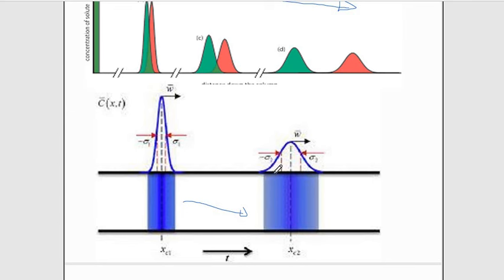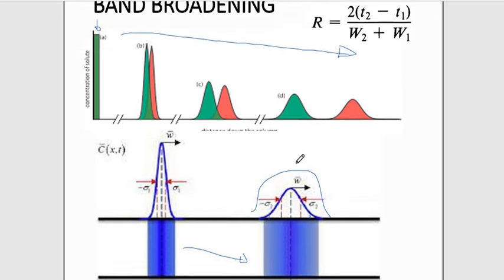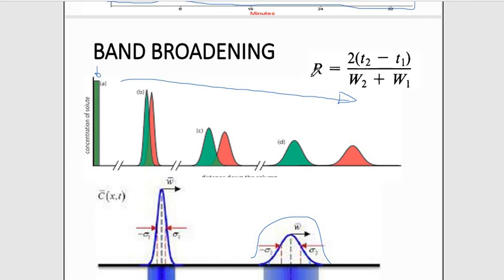Now, the base difference for the peak of each analyte is what they call the width, or the base width. So when I take this particular peak, the distance between this part and that part is what I call the width of the peak. If the band for the analyte is very broad, then it will have a very wide width. So basically, if the band is broad, the peak tends to have a very broad width, and the resolution tends to be very poor. Resolution is the measure of separation between two peaks. For a broader band, it tends to have a very poor resolution.